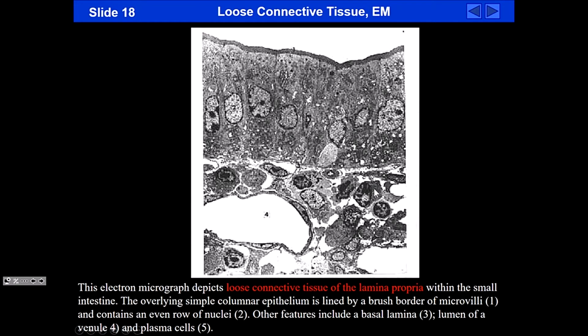Not always. It depends upon the epithelial sheet. You might have a basement membrane, you might have some smooth muscle right there. But a lot of the time, yes, you will have loose connective tissue to varying degrees. There's quite a bit here. You might have just a little bit. To varying degrees, you may have loose connective tissue underneath an epithelial sheet, but not always. Other questions?